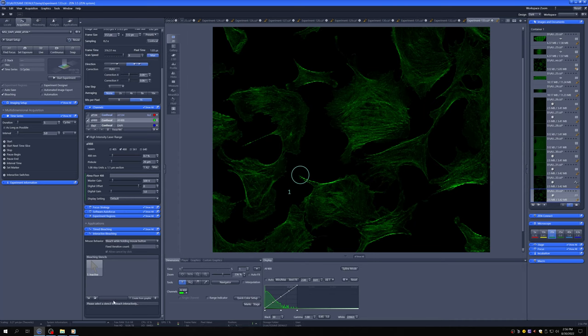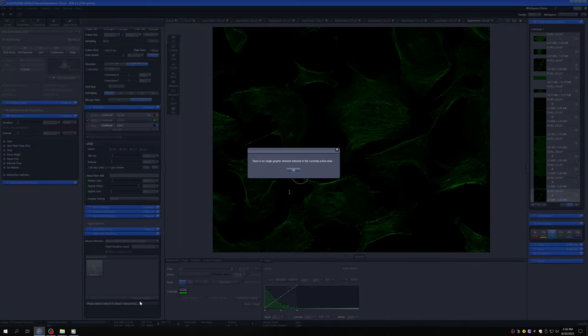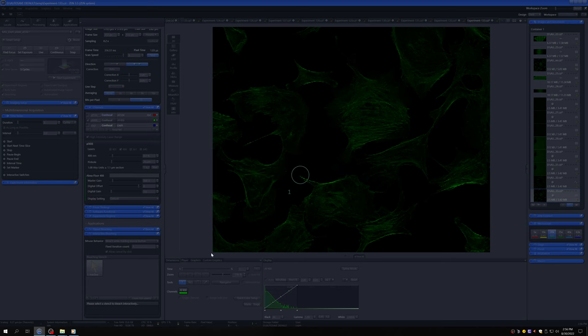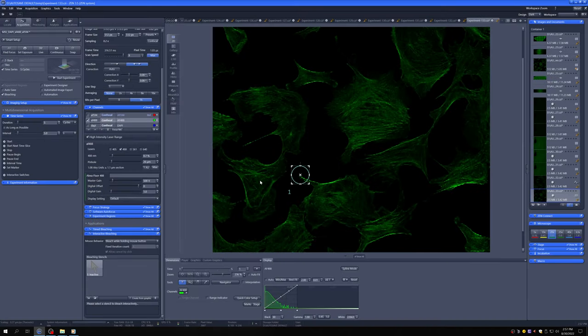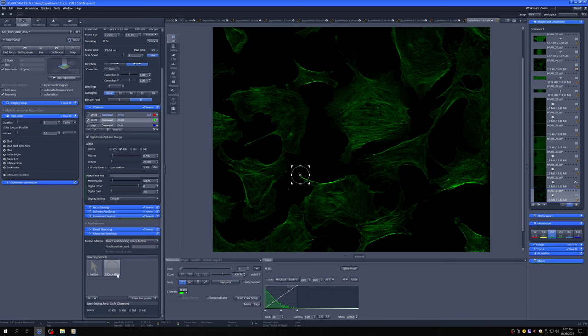So let's create that. Go here and create from graphic. Whoops, I seem not to have selected anything. Okay, I've selected that now. Create from graphic. Okay, so we have this circle here.